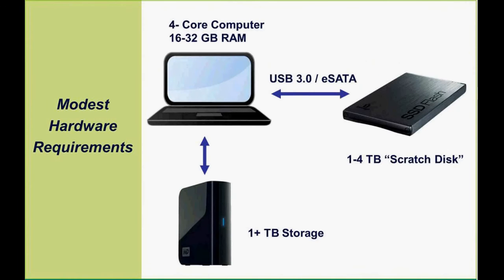One of the most common questions that comes up is, what type of computer do you need to run these assemblies? And of course, as computers get faster and as data sets get bigger, these requirements change a little bit. But what we really strive for is that you don't have to have a supercomputer to handle even the largest data sets. These modest hardware requirements do have some specific requirements, though, and that's the type of computer for anything aligning to, say, a human genome.